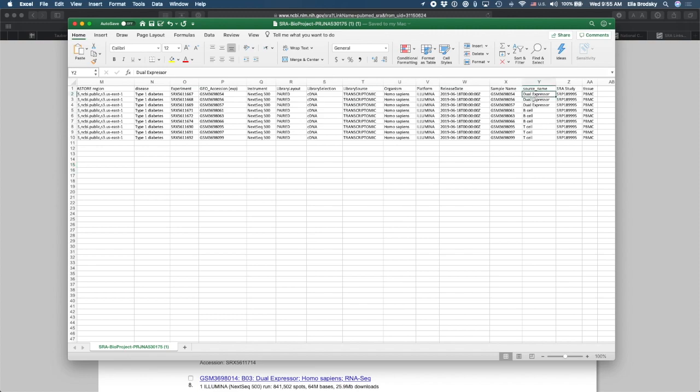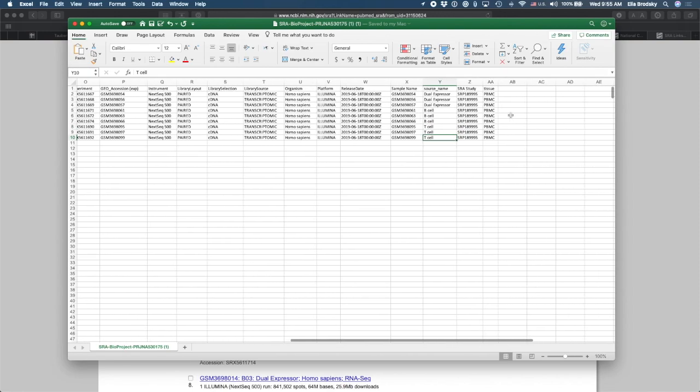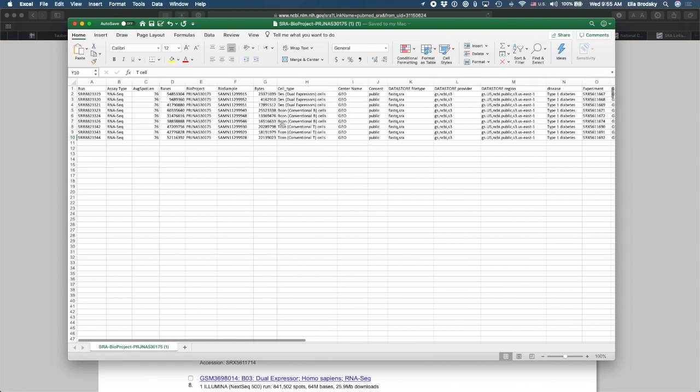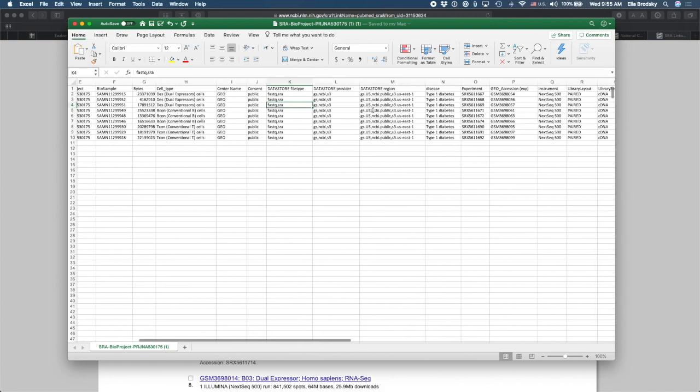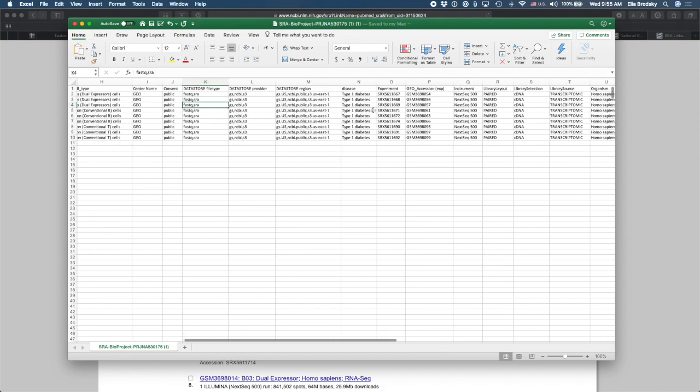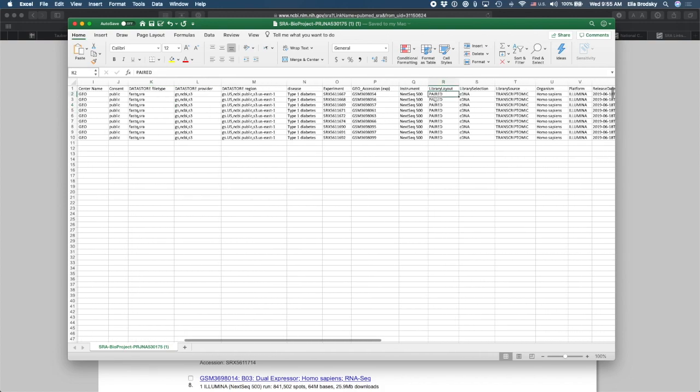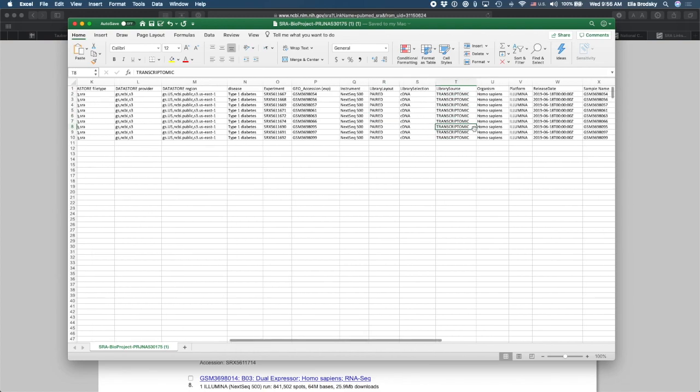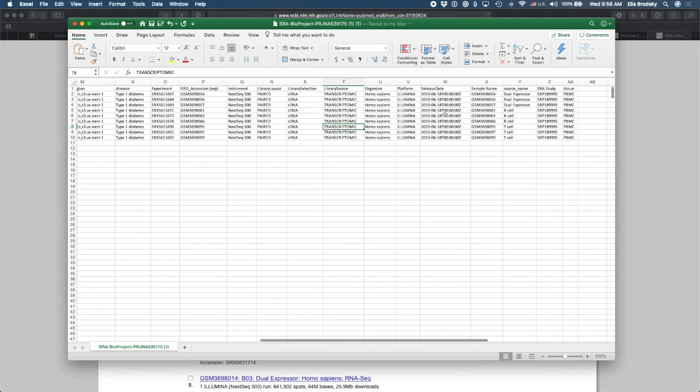Some are dual expressors. Some are B cell. And some are T cell. And what I'm also going to look for is the information about what kind of sequencing was done. How do I find that? Here I can see that these are FASTQ files that are packaged in SRA. And I can also see that these are paired end library layout reads. And this is transcriptomic data. In other words, it's gene expression data measured in the transcriptomic data.